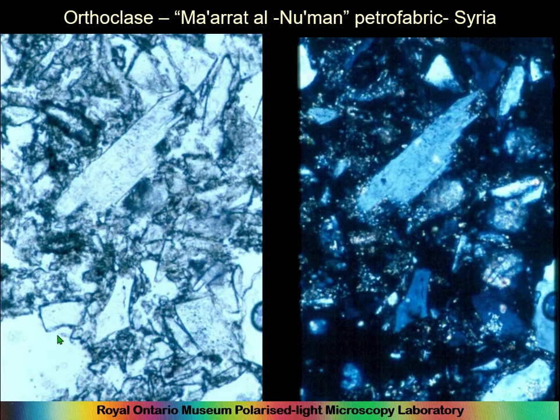And so here it's mostly quartz, but this is a feldspar, probably orthoclase. We'll talk about distinctions between the feldspar when we get to twinning, which is the distinction between them. But one of the interesting things about the feldspars is that because they have a cleavage and quartz doesn't, they will often fracture into blocky shapes.